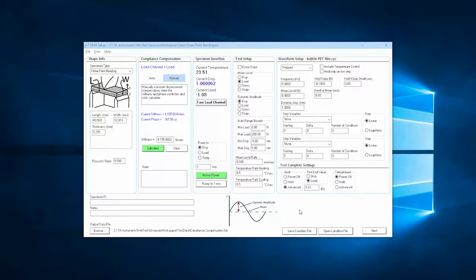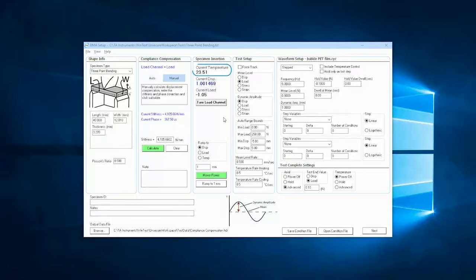The current displacement and load sensor readings will be displayed here. For systems with temperature control accessories, the current temperature will also be displayed in this section.